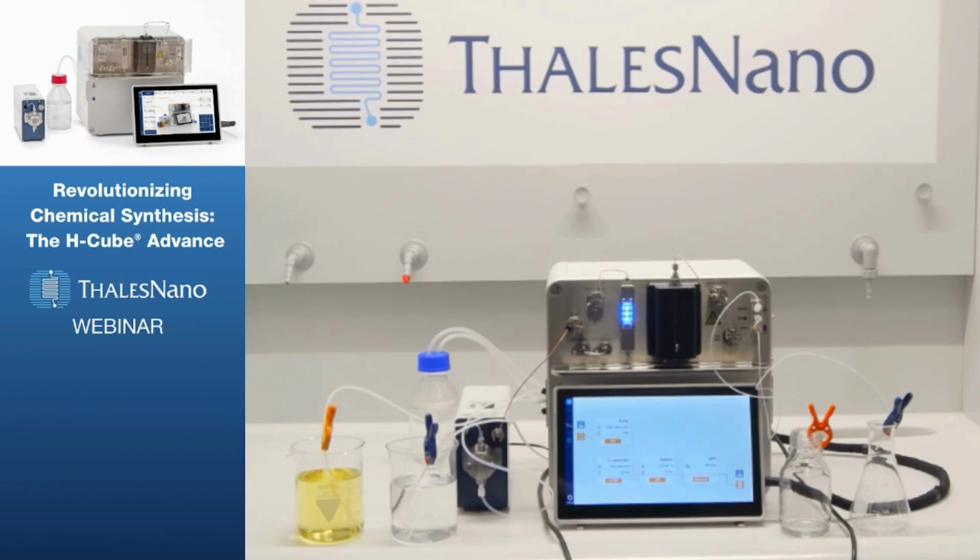It takes about 15 to 20 minutes from start to finish to do an experiment in these instruments, so that's very useful. You can immediately see that it's a lot faster compared to batch protocols.